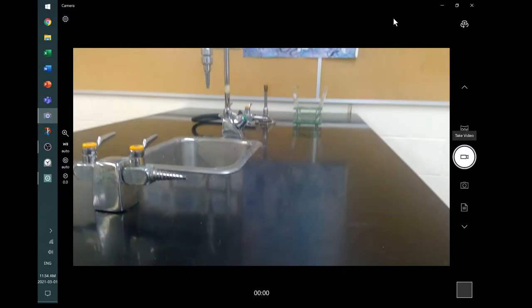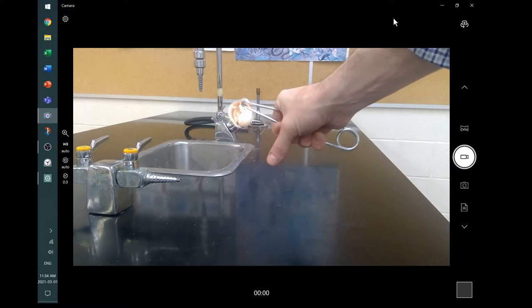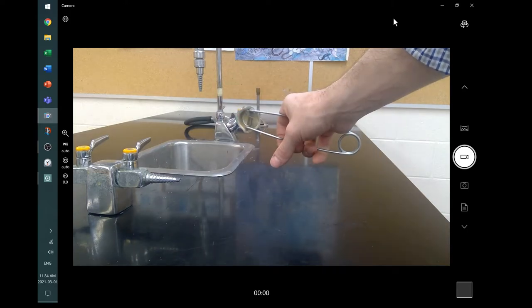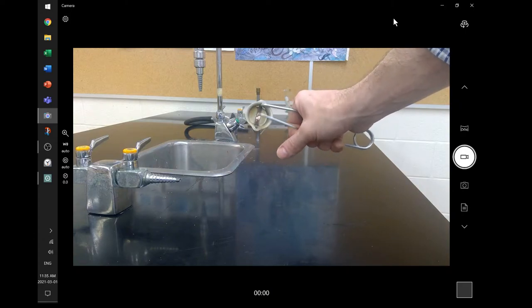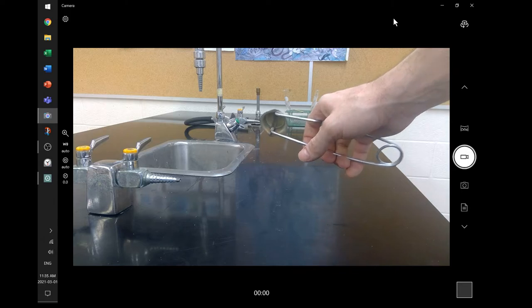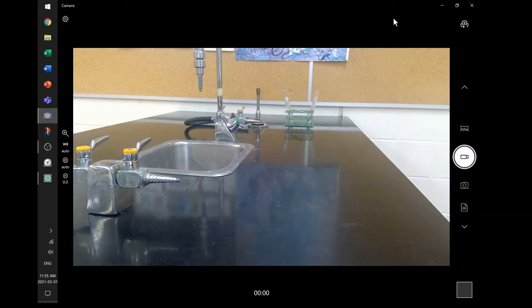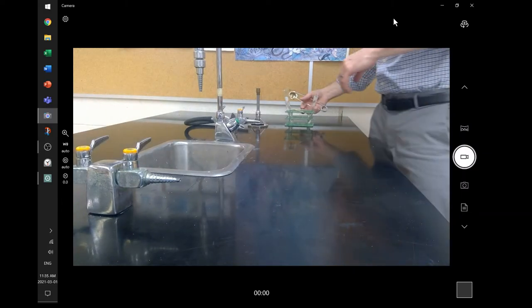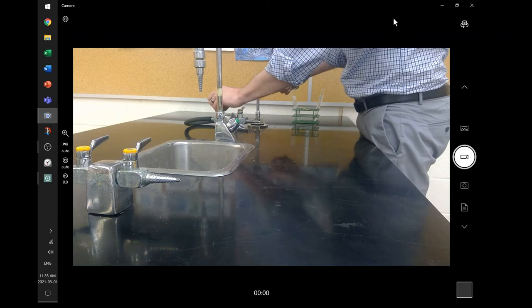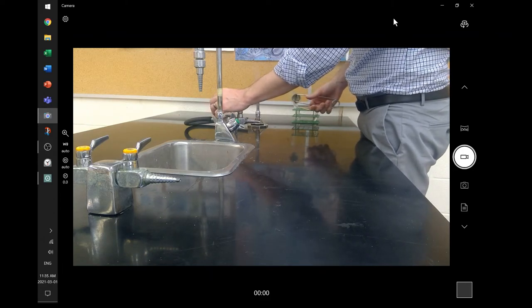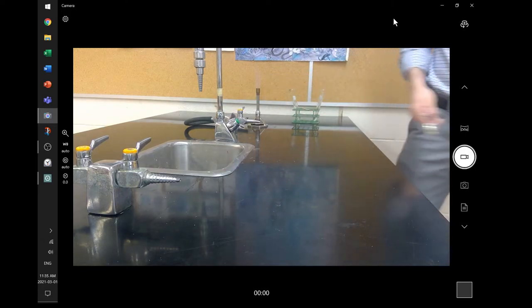So, first test, magnesium ribbon and hydrochloric acid. And I need to do a few pieces to get that started. What I have here in my hand is something called a striker or a sparker. And it's got magnesium in the end piece there, a little piece of sandpaper for lack of a better term. And striking it back and forth exposes the magnesium. It strips off the old layer of magnesium, exposing fresh magnesium. That reacts with the oxygen in the air and gives you little sparks. Now, this piece of equipment here I have is a Bunsen burner. The gas is off. I'm going to put my striker on it, open up the gas, and get a flame.